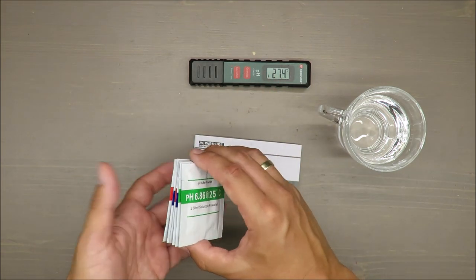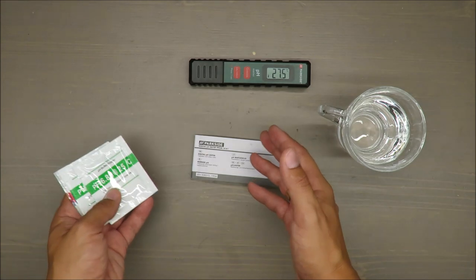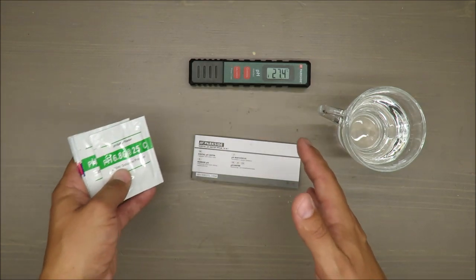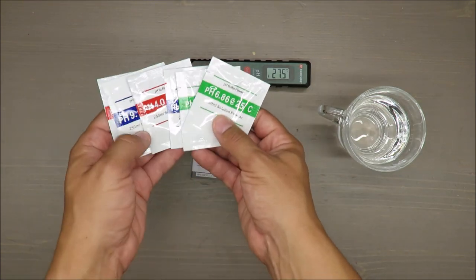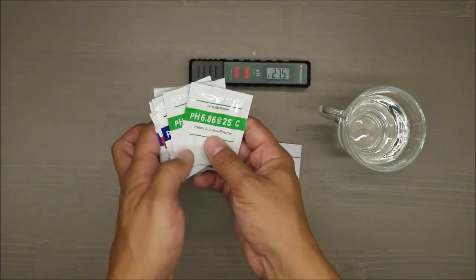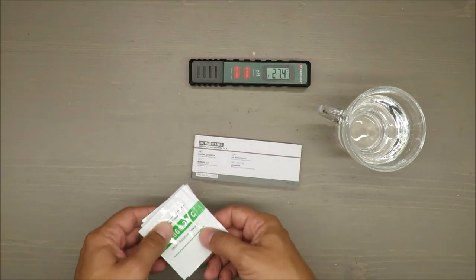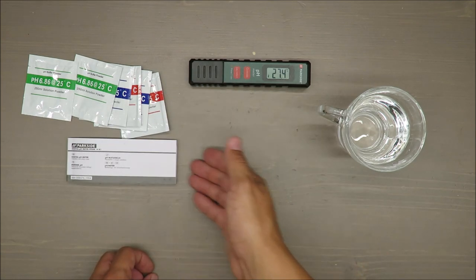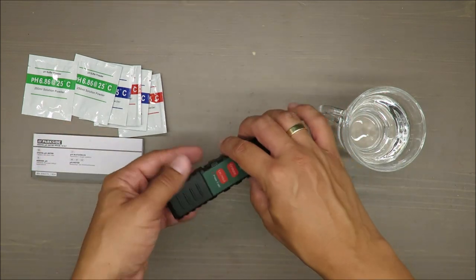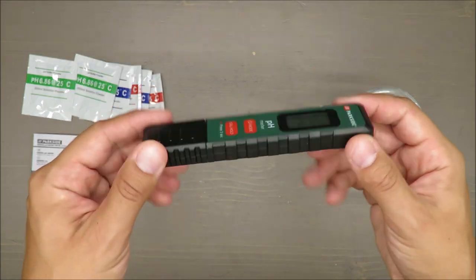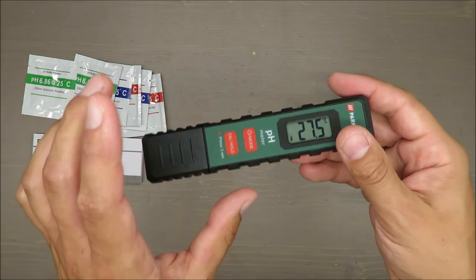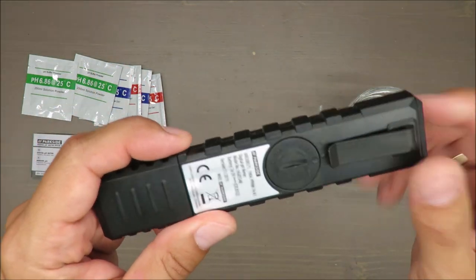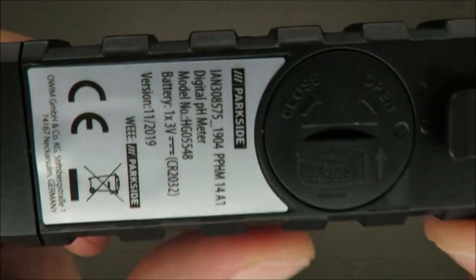Scope of the delivery: you've got, as I mentioned, some buffer powders in order to make a calibration of it, manual (I'm a regular guy so I will not use it), and the pH meter. Together with the pH meter you've got a battery that is included. For people that are curious, it's a CR2032.